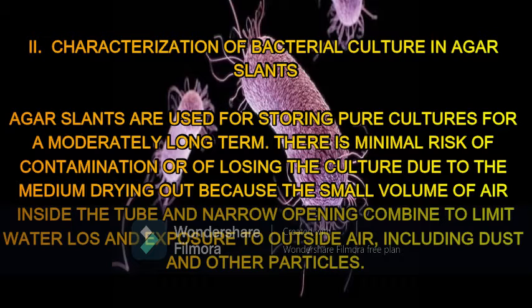With that, we will characterize the Pseudomonas aeruginosa grown in an agar-slant culture. For a brief rundown of its morphological characteristics, we have its shape, which is a slender rod-shaped bacterium. Size. The size of the P. aeruginosa is about 1.5 to 3 micrometers by 0.5 micrometer. The arrangement of cells. Pseudomonas aeruginosa is arranged singly or in pairs.